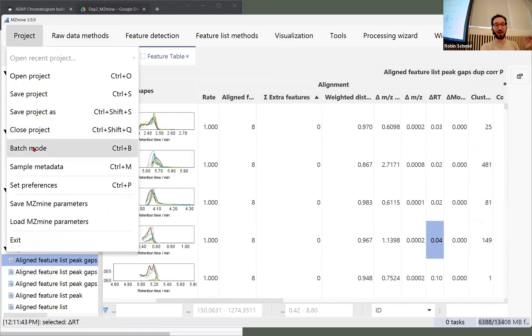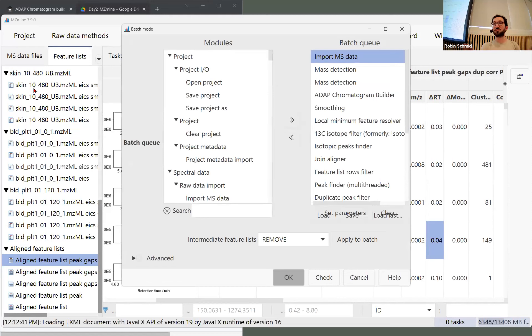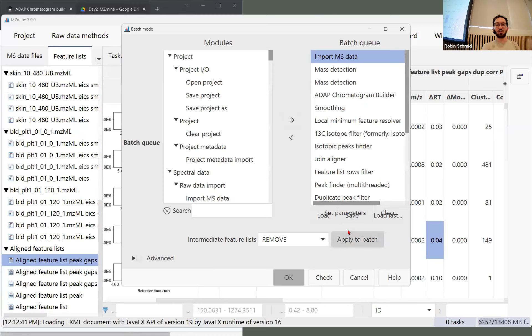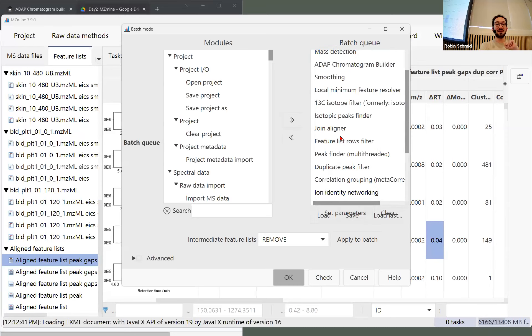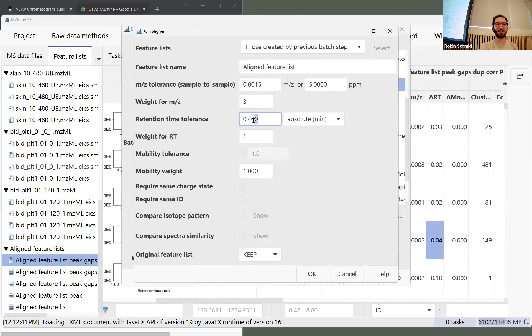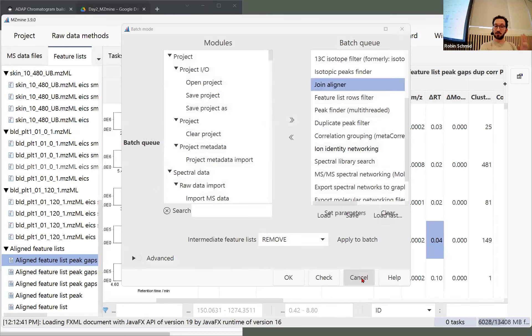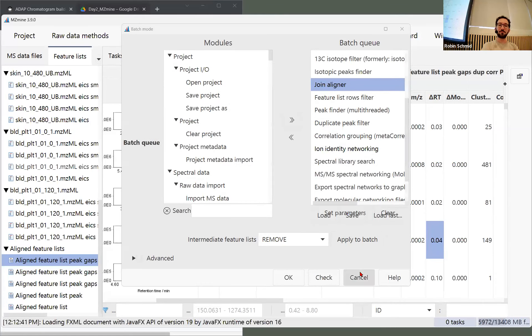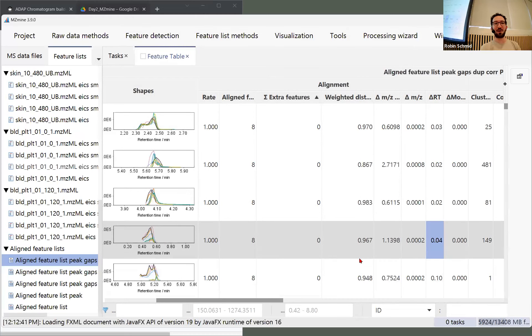I'd go back to the wizard or batch mode and just change those parameters — don't follow along here, I just want to show you how you could do that. The batch mode is actually the most important tool in MZmine because it runs all the modules and steps you set up, and it's reproducible — you can save it once it's optimized and share this file with your paper so people can reproduce. In here we have the join aligner step — open it and you see the 0.4 that we set on purpose way too high. We can set it to 0.1.